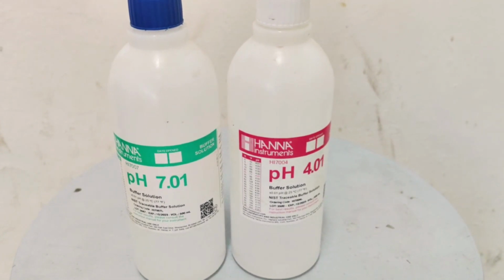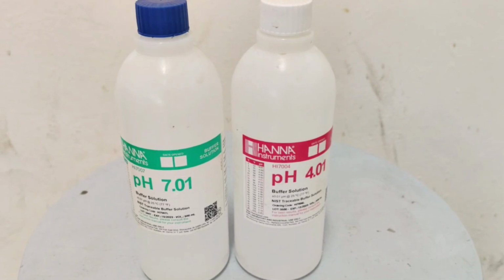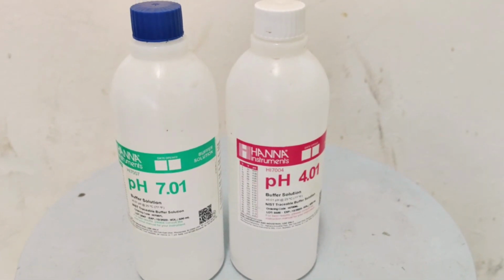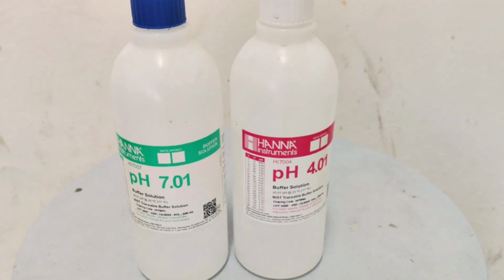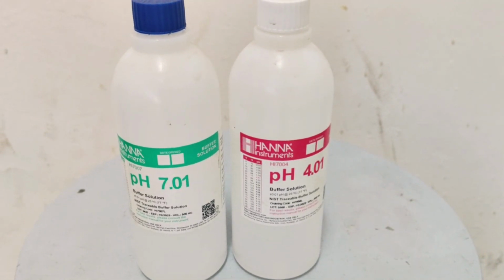A pH 4 solution, being acidic, is used to calibrate pH meters to ensure accurate measurements in acidic environments. Similarly, a pH 7 solution, which is neutral, is used for calibrating pH meters to provide reliable readings in neutral conditions, ensuring proper growth conditions for bacteria and accuracy in experimental results.